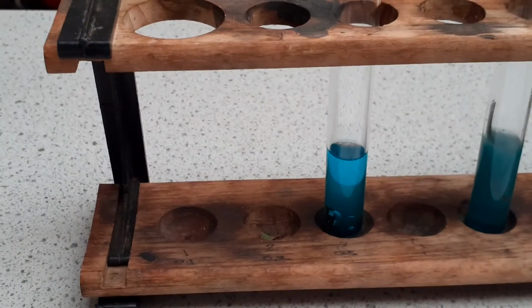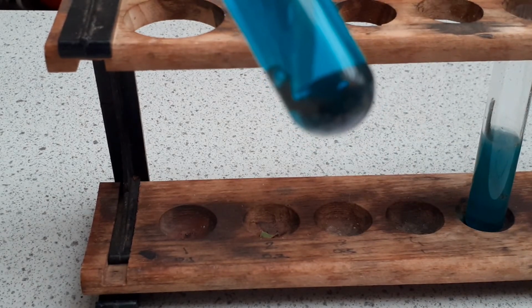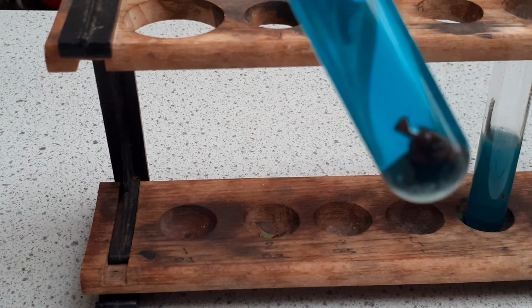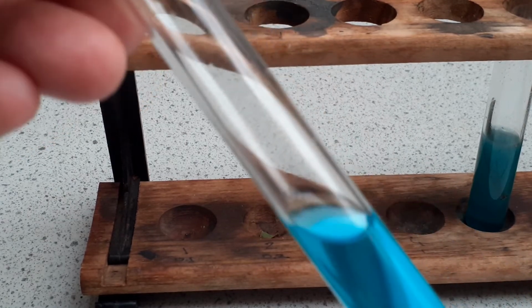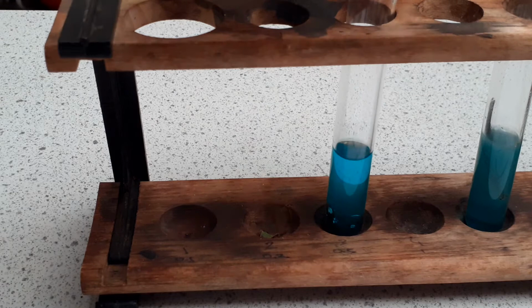Now, let's look at the zinc. If we look at the zinc, you can see there's reddy brown there and copper is displaced there, and also you'll notice that the solution is slightly lighter than when we started.